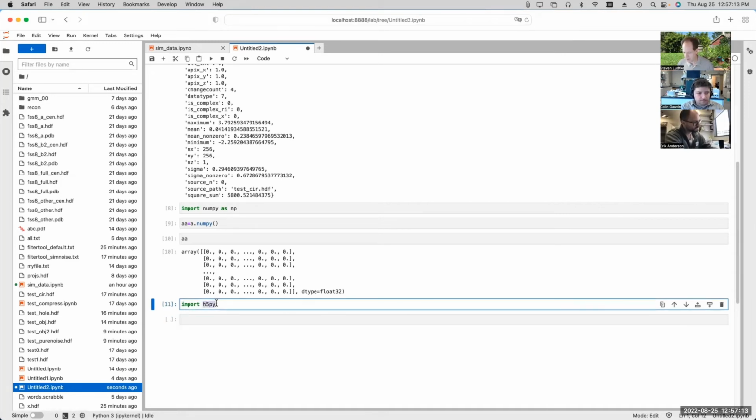And it will, but it won't write them into HDF5 files in the same way EMAN does. So this library massively simplifies HDF5 files. So you can only write certain types of raw image information into the files. And if you write files this way, you won't be able to read them back in EMAN or in Chimera, or, well, actually Chimera you might be able to, because Chimera actually uses this library for some purposes. But you won't have header information. You won't be able to do a lot of things with it. So you shouldn't use libraries like this.